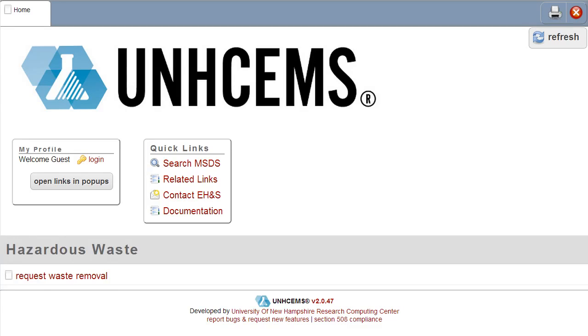In this video, I will show an overview of the UNHCEMS system. UNHCEMS was developed in 2000 by the University of New Hampshire. The goal of the system was to effectively manage chemical inventory and safety data sheets in a university, research-oriented environment.